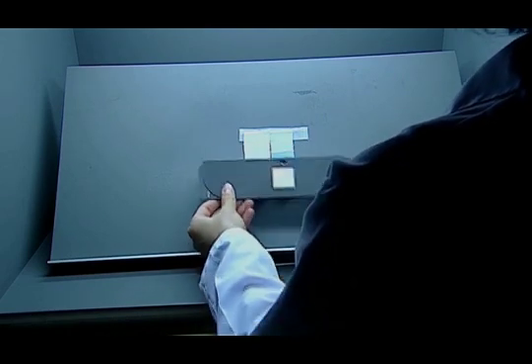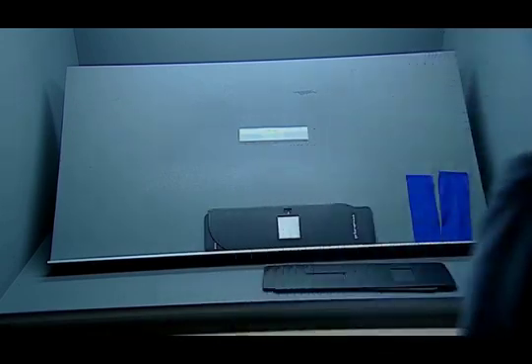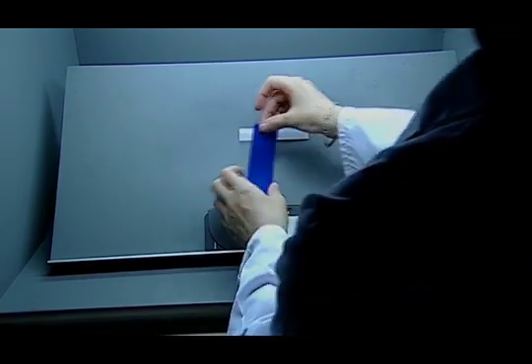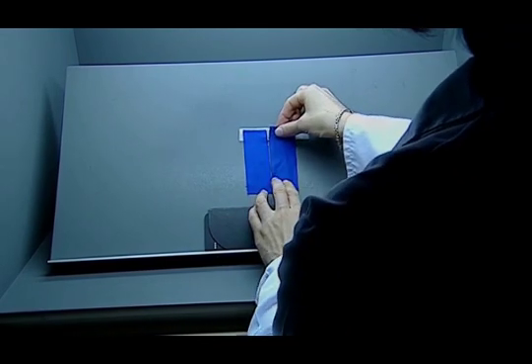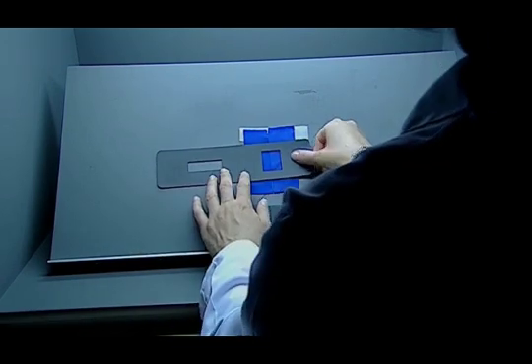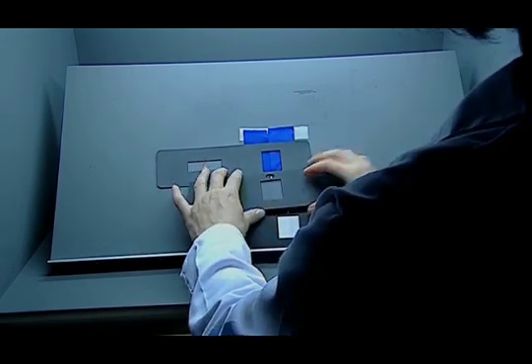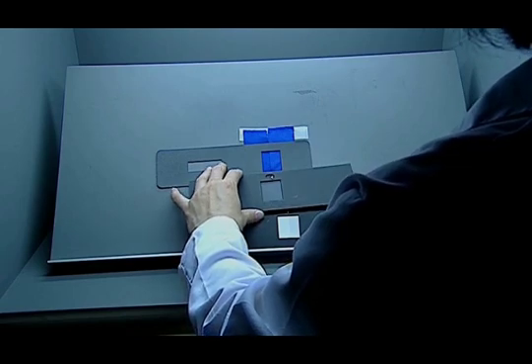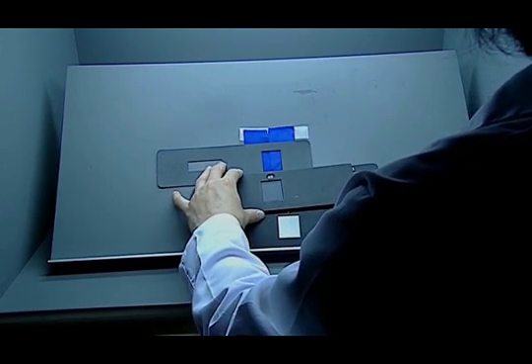Then, the test sample is evaluated. The tested sample and original sample are put side by side, and the fading scale is used. The scale is rated from 1 to 5. The evaluation of the sample is finished by finding the appropriate value.